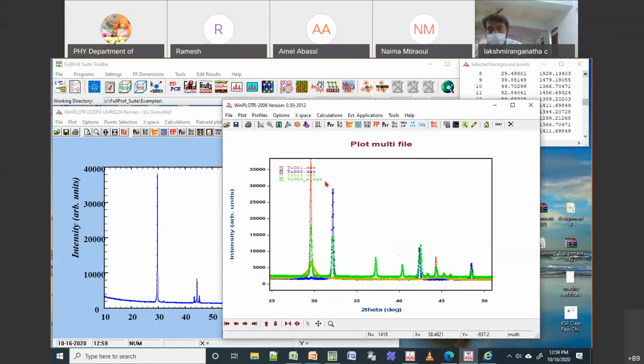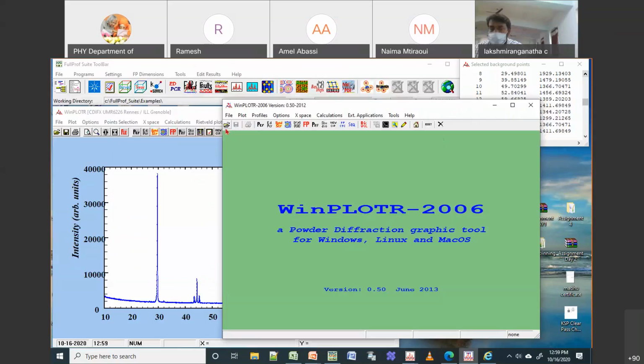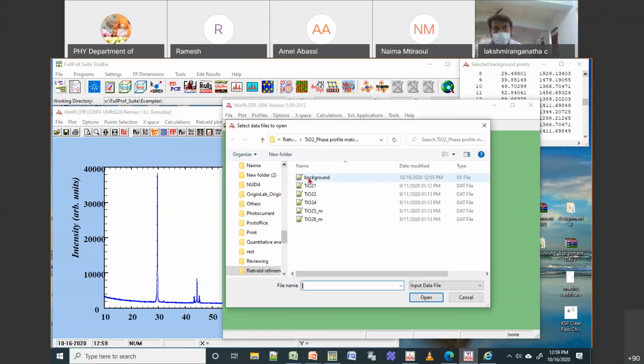It is a 2D view. If you want to see a 3D view, you can see here there is something that says open 3D model. So if I click this, I think if they are having the same X coordinates, like if your step size is the same, then you can also see 3D views. In this case it is not taking, so it's fine. I'll try to take some other example.